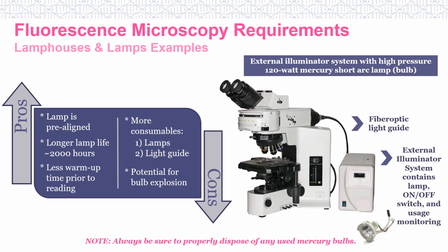Although these involve a higher upfront cost, these units claim to provide considerable savings over the unit's life, require no warm-up time, and bulbs can last for greater than 10,000 hours. Every FISH laboratory has their choice of illumination system options, which can be selected based on their budget and safety concerns.